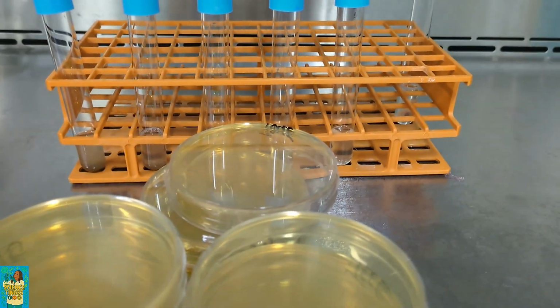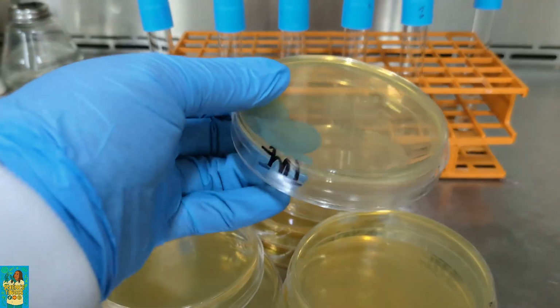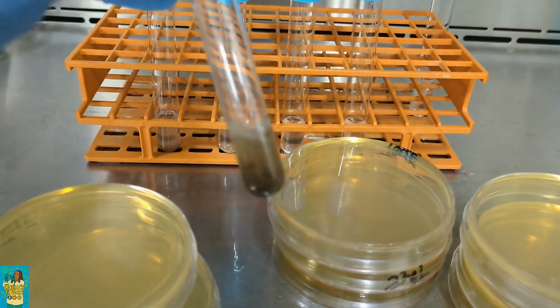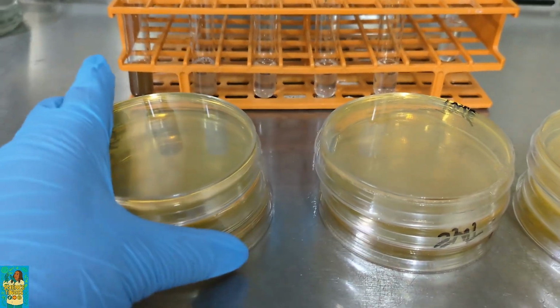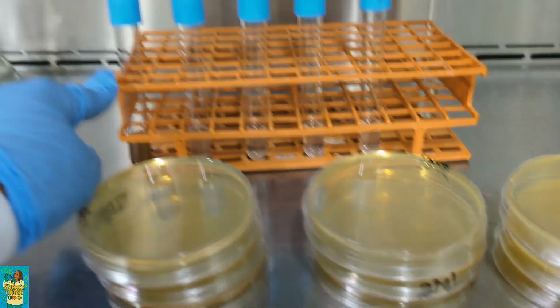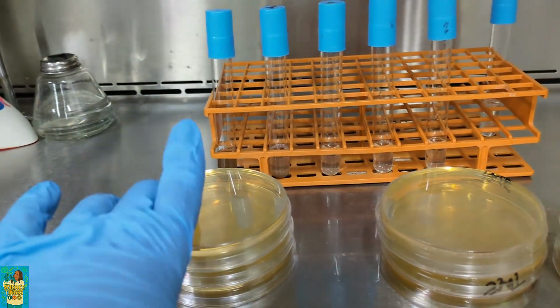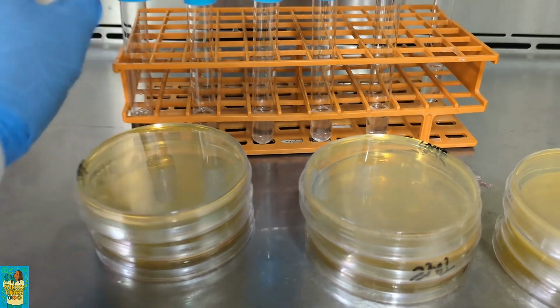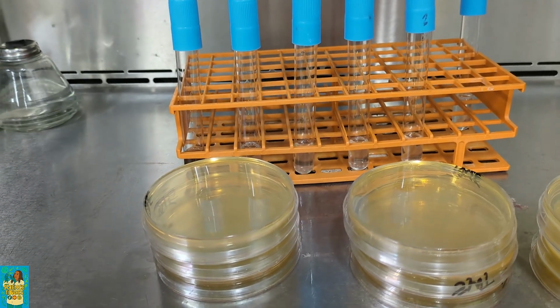Many hours later, I had to take not a break, but I had to make up the medium, the agar that I am going to grow or isolate the soil fungus on. And this media isn't the general one that I use for growing fungus. This particular soil fungus, I include some different things in the media so it will select for the particular fungus that I want while preventing ones that I don't want from growing.